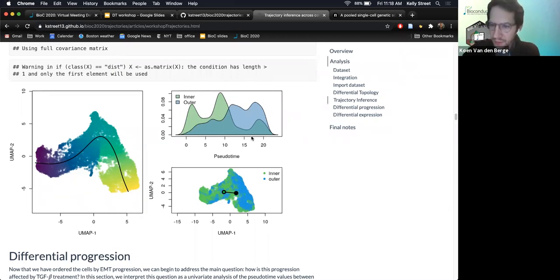We have another question. After integration, do you use the batch corrected expression values or the original raw counts with a batch factor? I'm asking because the batch corrected values from MNN integration should generally not be used for quantitative analysis. So I guess that this is already kind of pointing at the later differential expression analysis. And there we are not using the batch corrected values for differential expression because we've also seen that these are not recommended to be used. But we do the batch correction or the integration for the trajectory inference and to get the trajectory right.